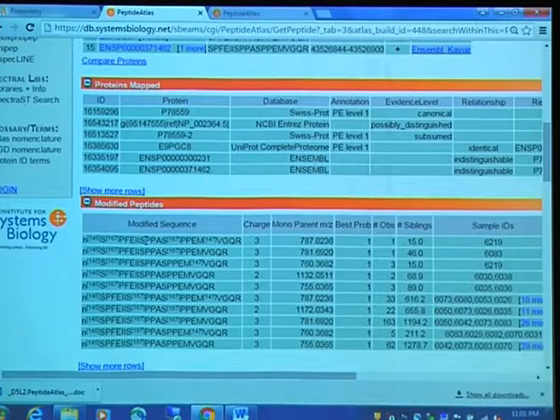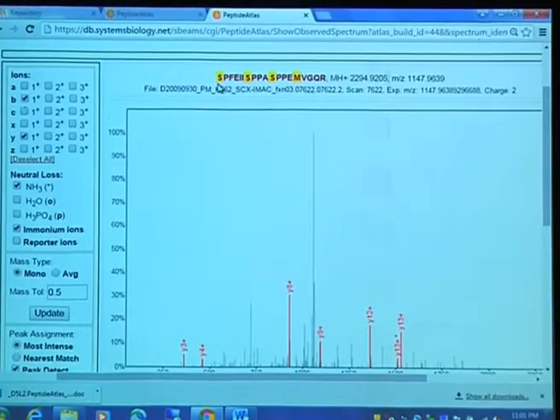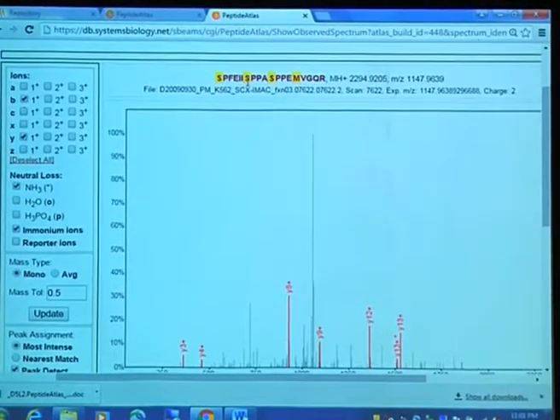So according to the original peptide spectrum match, this one was not in fact phosphorylated, whereas this serine was. And if you go further, there's a methionine that is oxidized. So M147 is oxidized. The charge is represented here. I'm going to go back over to the spectrum tab. Within the spectrum, any amino acid that is modified is highlighted.